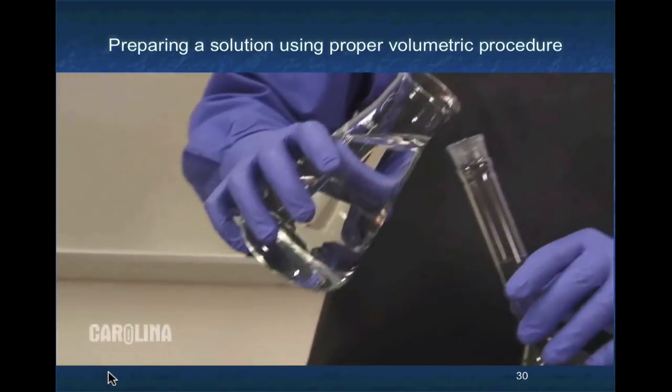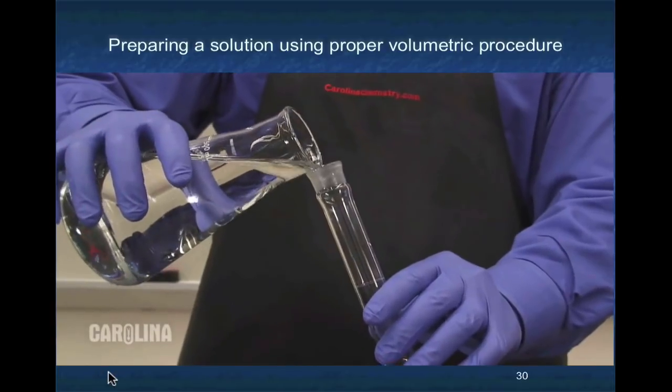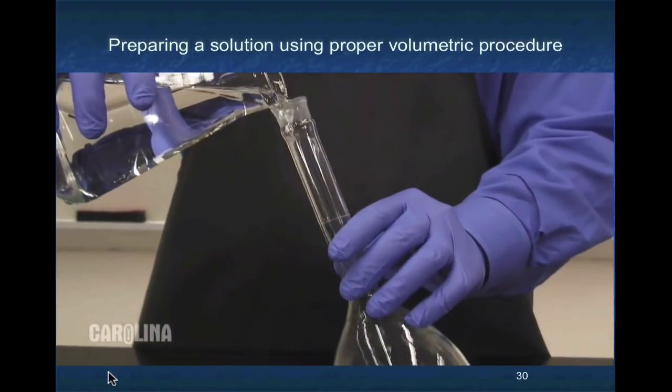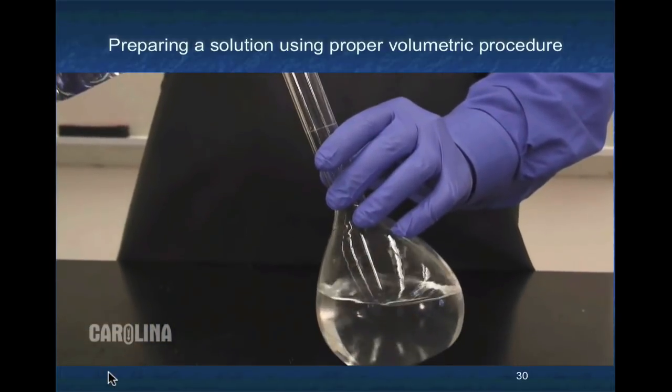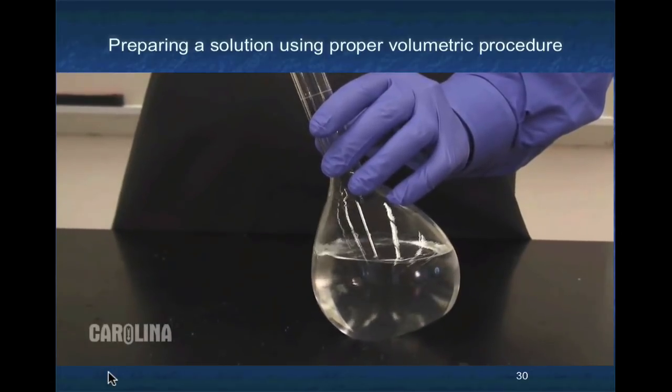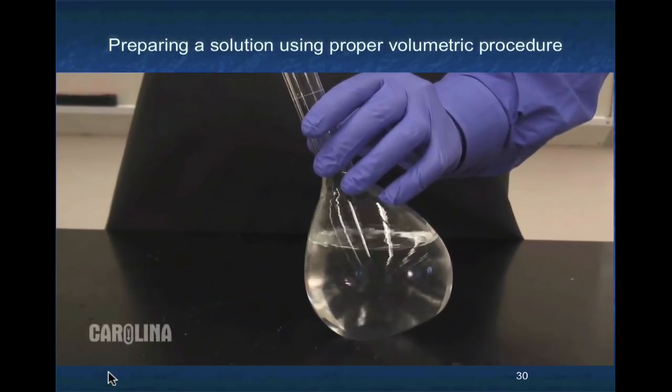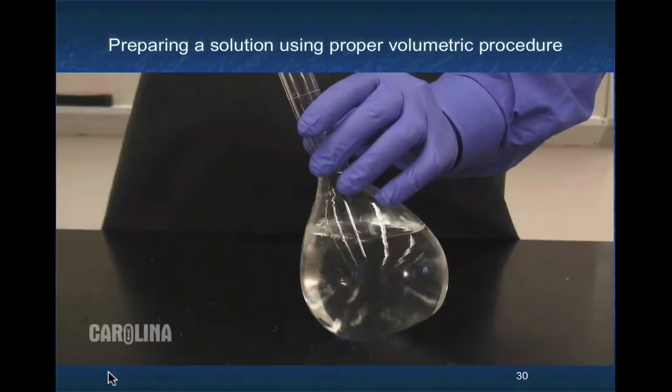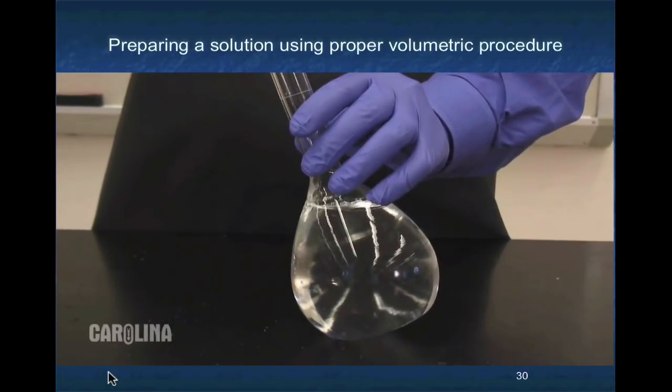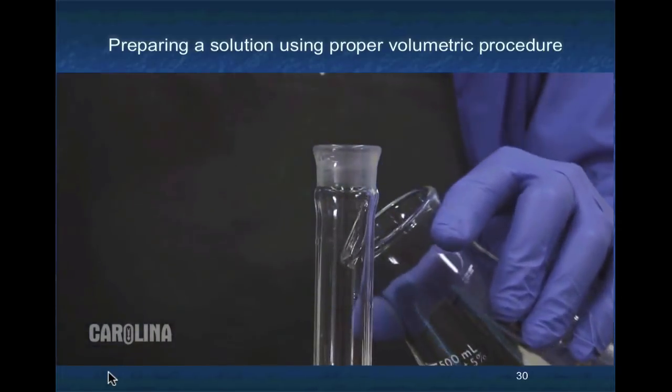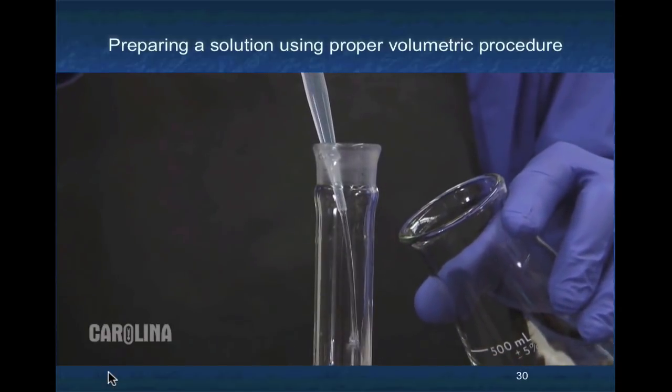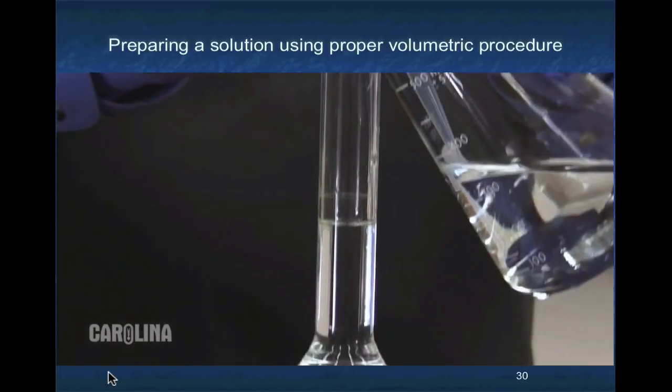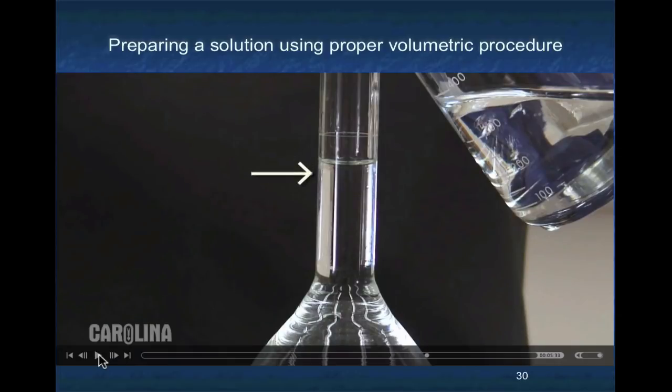Now that the sodium chloride is completely dissolved, we can fill the rest of the bulb area and some of the neck with water. You should now carefully and slowly add water, or solvent, as it begins to fill the neck. Once you approach the etched or printed line on the neck of the flask, you should add solvent dropwise, monitoring the location of the meniscus. Water, as a polar solvent, tends to cling to the glass walls.